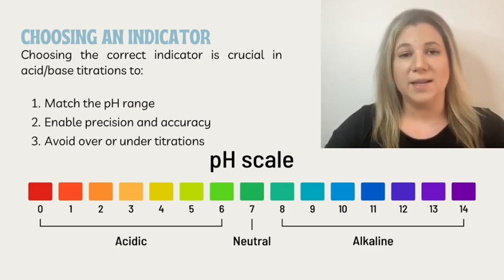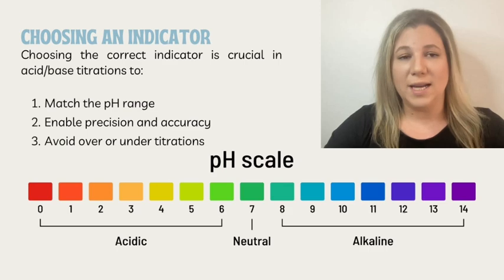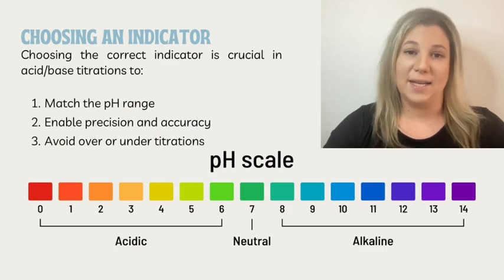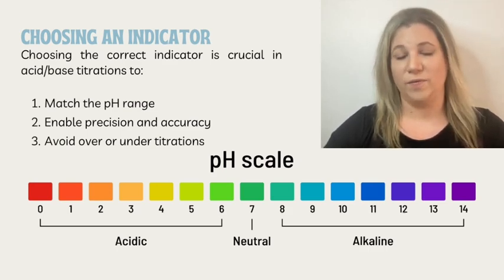It's important in titrations because titration is not your run-of-the-mill measuring. It is an accurate, quantitative way to collect data, and we want it to be as accurate and precise as possible. And that's important to convey to your students as well.